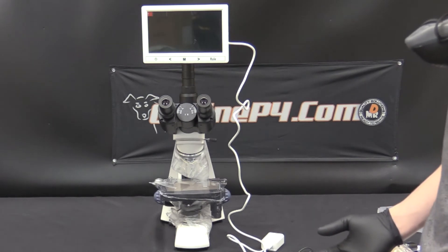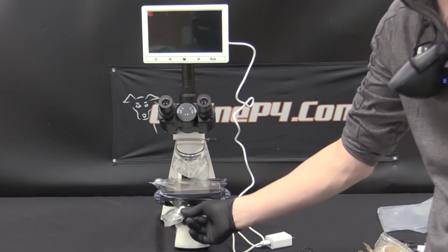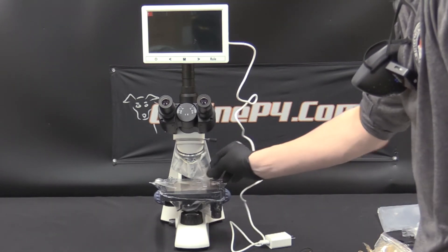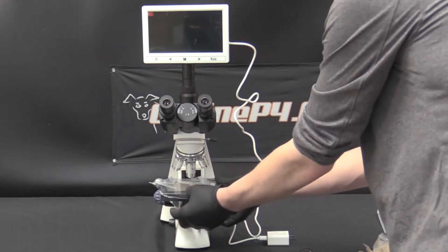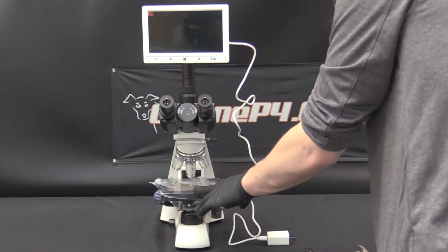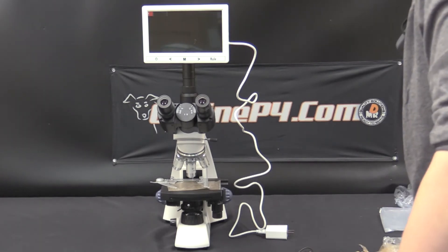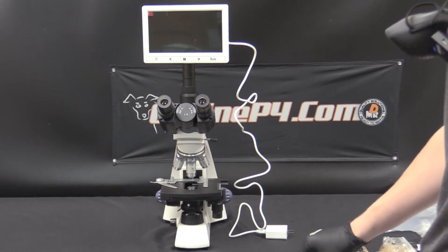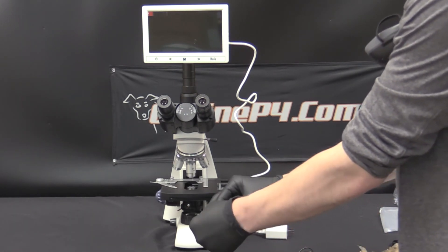Now after you remove the plastic packaging from the mechanical stage, the packaging over the lens, the packaging over the light source, and the objective lens — carefully puncture the wrap with scissors or a knife and peel the rest off. There is also a covering over the aperture. We want to be sure not to scratch these. Anything with the lens we should be very careful to avoid getting scratches or dust on it. When not in use, please put them away into a plastic bag somewhere safe.